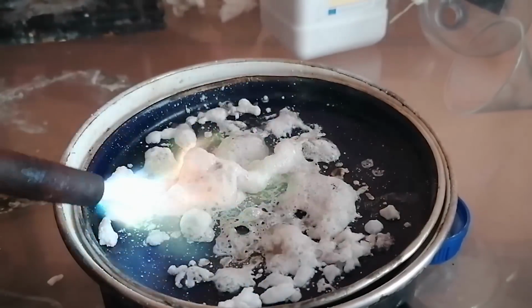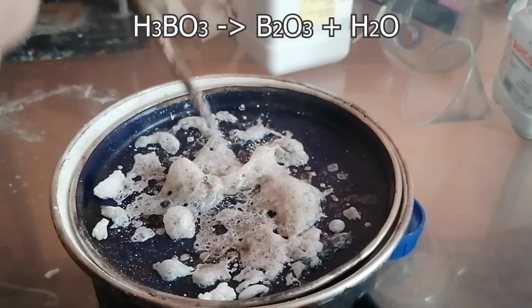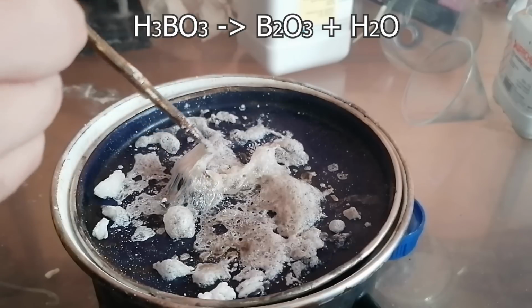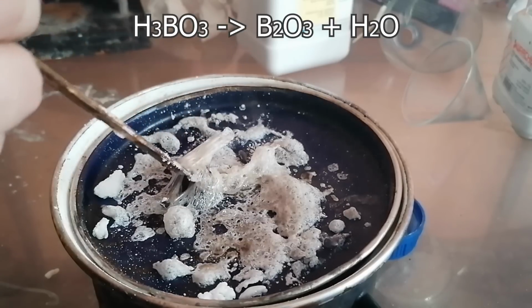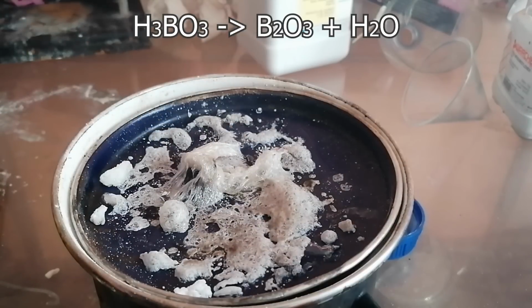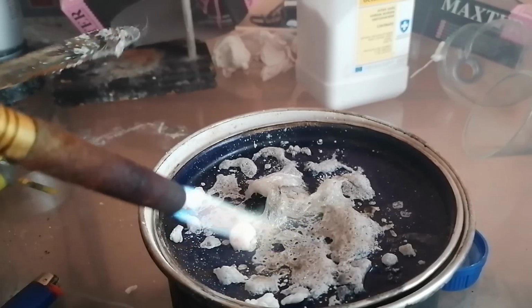As I've heated it, some portions of the boric acid lump started bubbling, which is a good sign. What's happening here is the boric acid is being broken down into boron trioxide and water. You can see a bunch of steam coming off as the reaction proceeds. Eventually, most of the boron trioxide has crystallized, and you could say that it's basically raw borosilicate glass, but without the silicate part of course. Finally, the boric acid was mostly converted into boron trioxide.